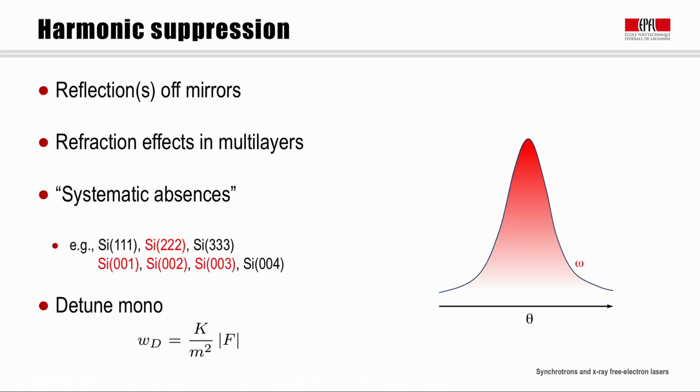Now I say nominally as their complete suppression assumes that the electron cloud surrounding each atom has a perfectly spherical symmetry, which we know not to be 100% valid. For example, the electrons associated with covalent bonding are far from spherically distributed. Hence, these reflections tend to be very weak but aren't entirely absent.